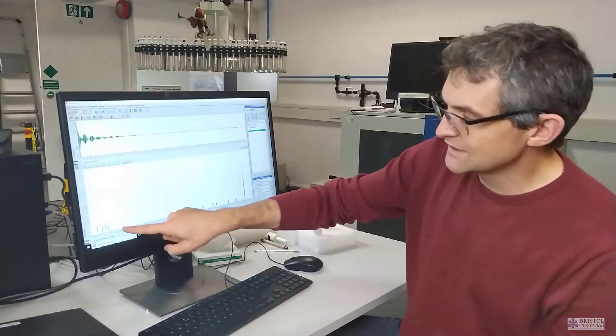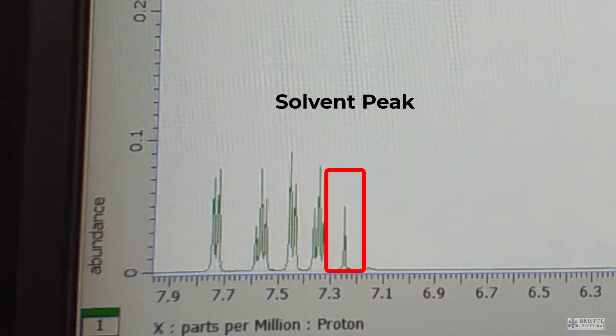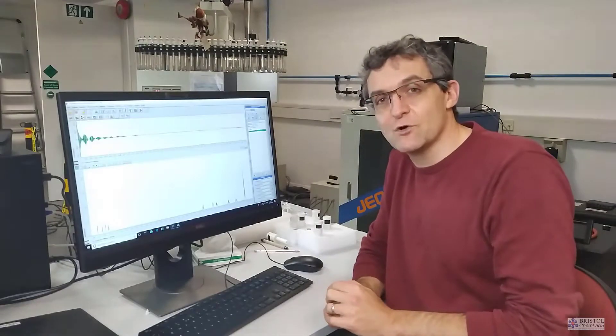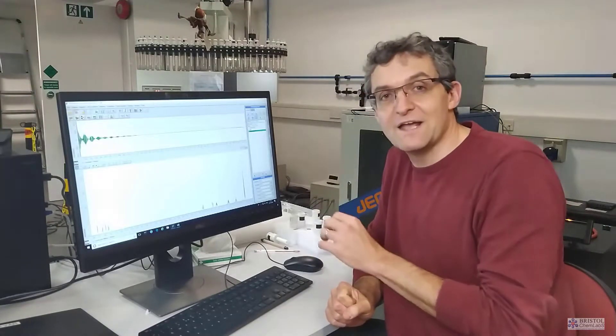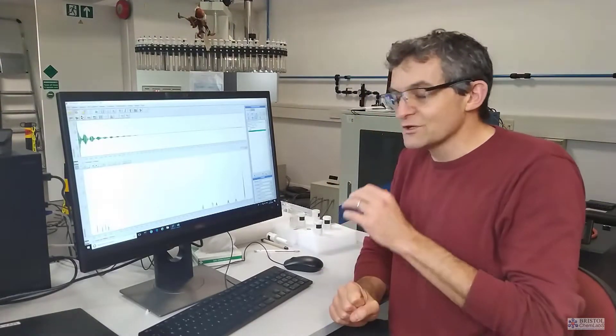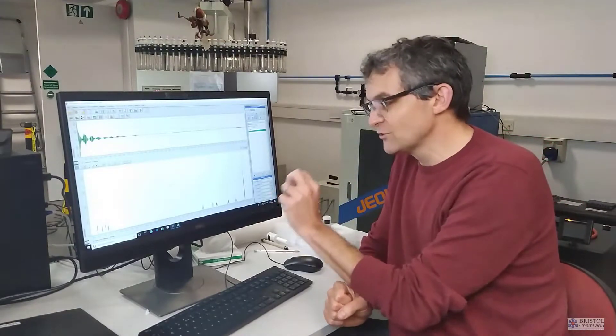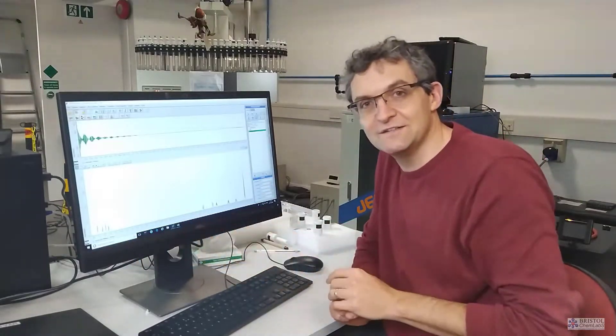One of them, this little spike down here, is the solvent. That's some residual protonated solvent that is remaining in the deuterated solvent that we added to our sample. The other 10 signals come from the compound that we dissolved up in that solvent. And what's really cool about NMR is every single one of these signals tells us the story.